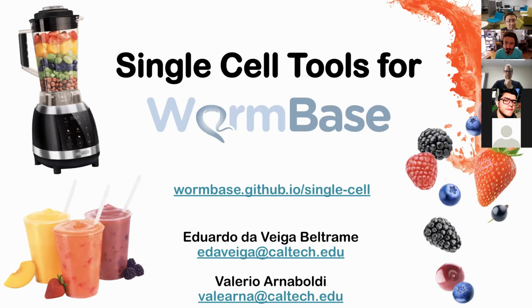Okay, cool. So I'm Eduardo, and I'm in Paul Sternberg's lab. And today I'm going to talk about single cell tools for WormBase that we have been developing.